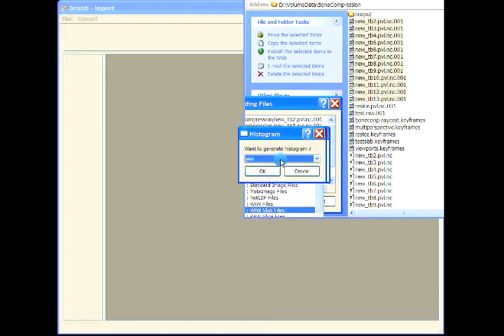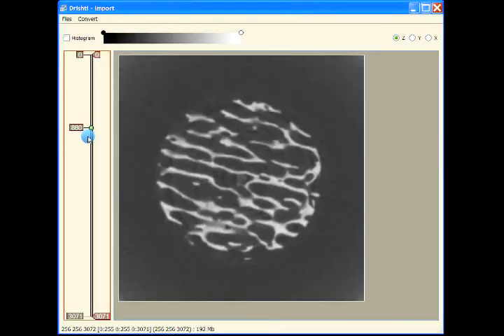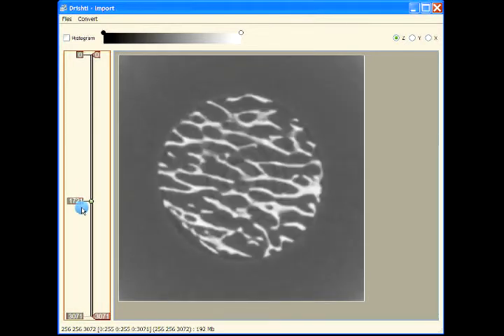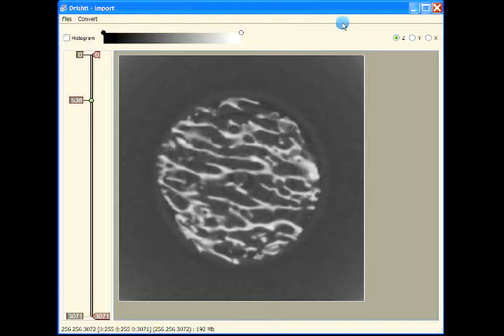And I don't want to create histogram. I'm just saving the time because I know it's byte data. So these are the different time steps. As you can see, we are going through multiple time steps here. So the total volume is 256 by 256 by 3072. It's not a particularly big data set, but for our demonstration that will serve the purpose.